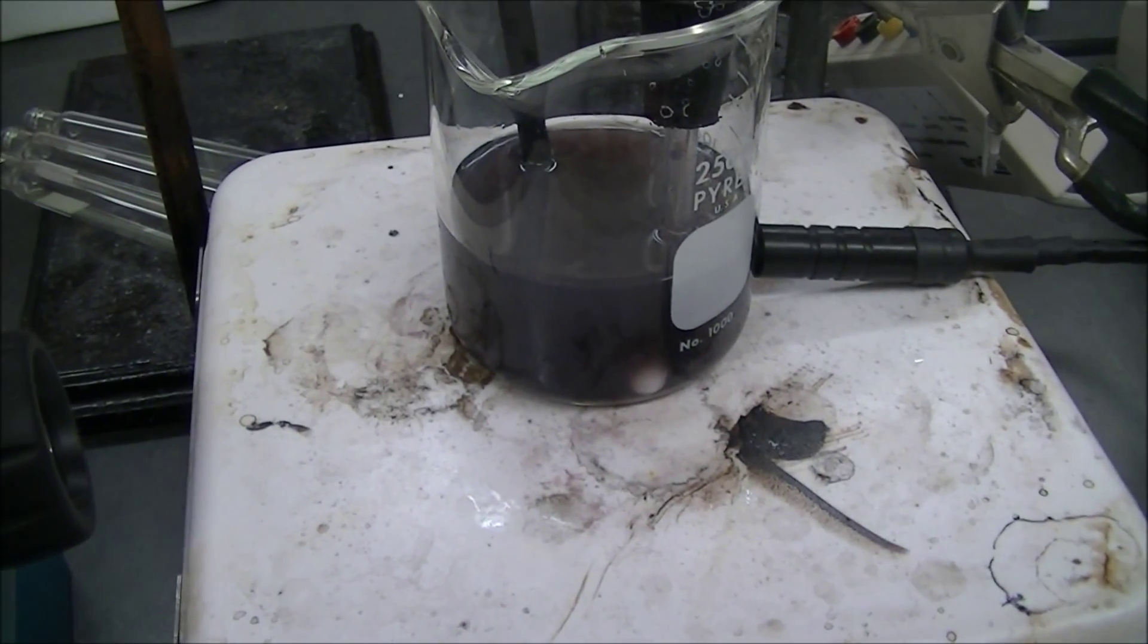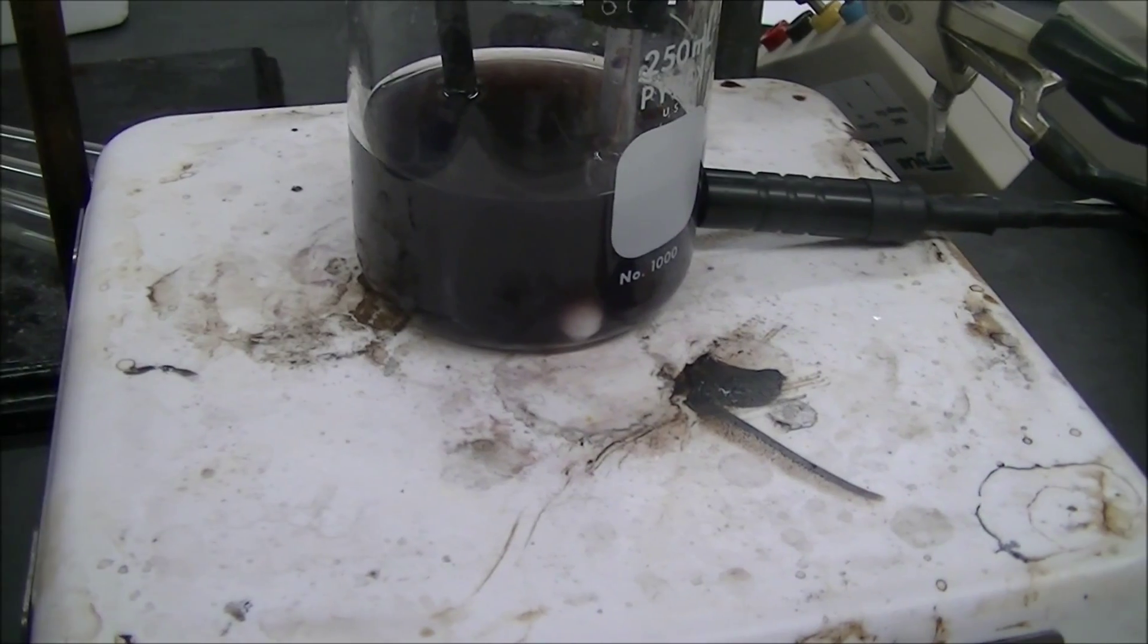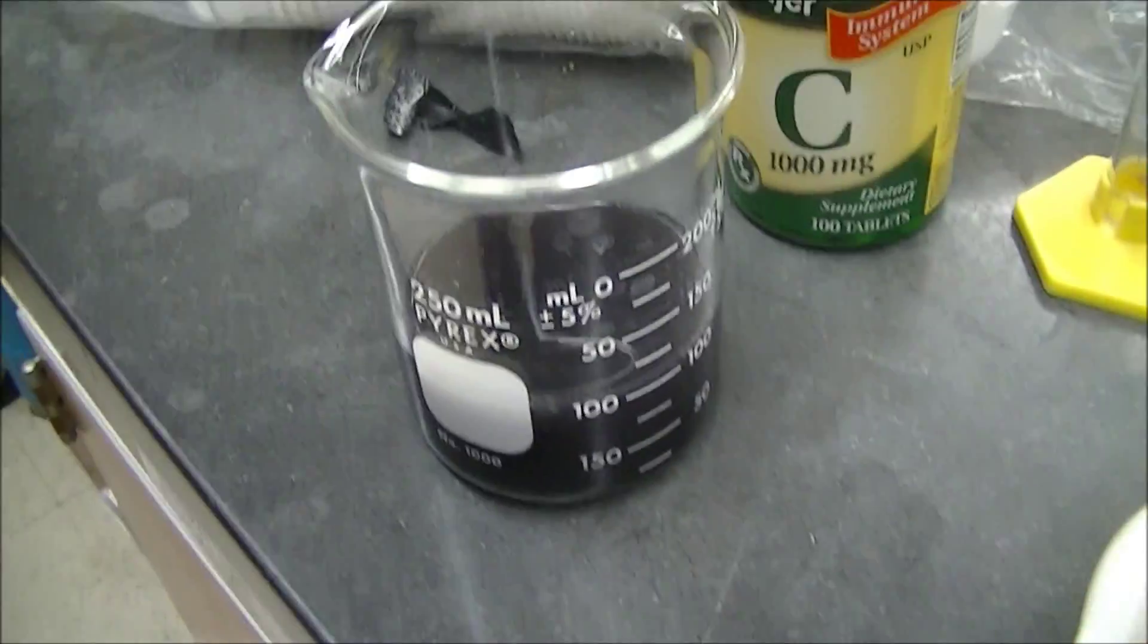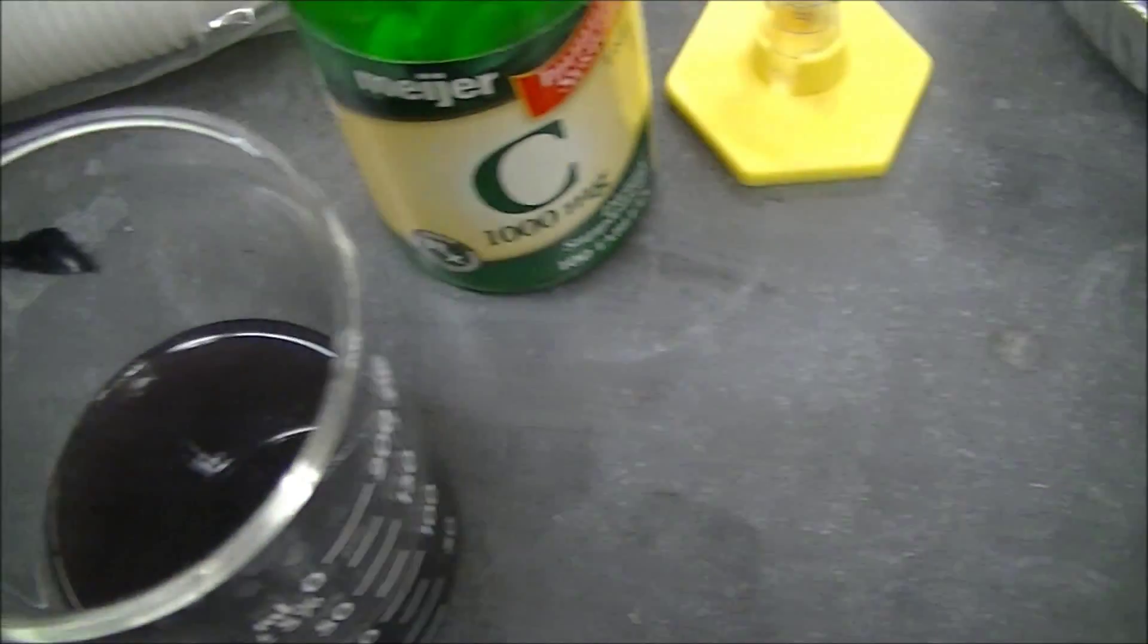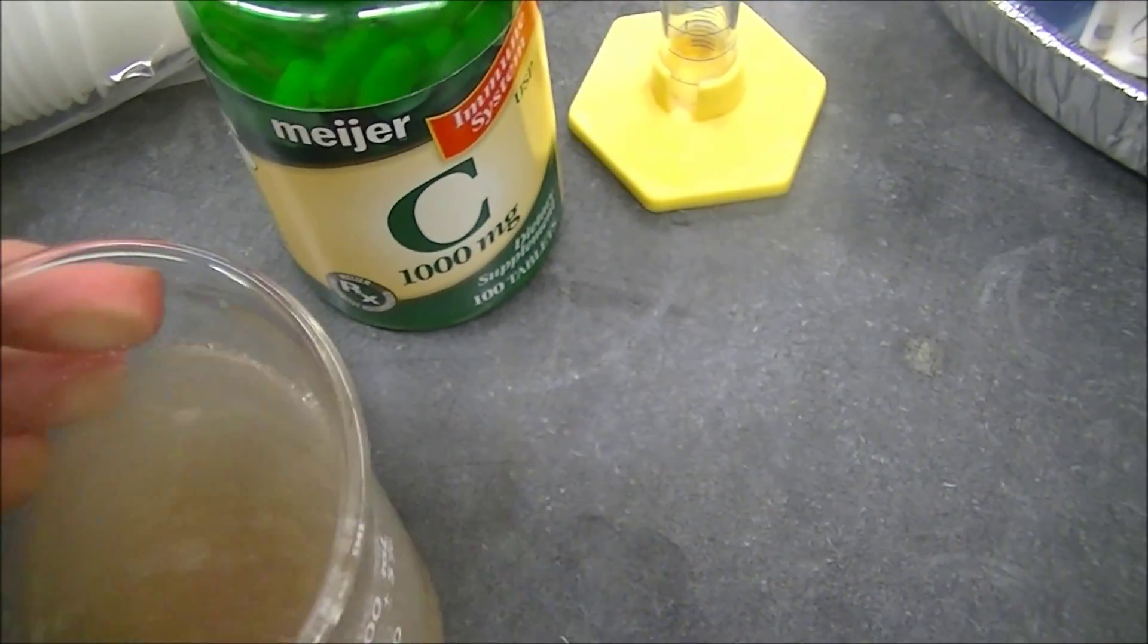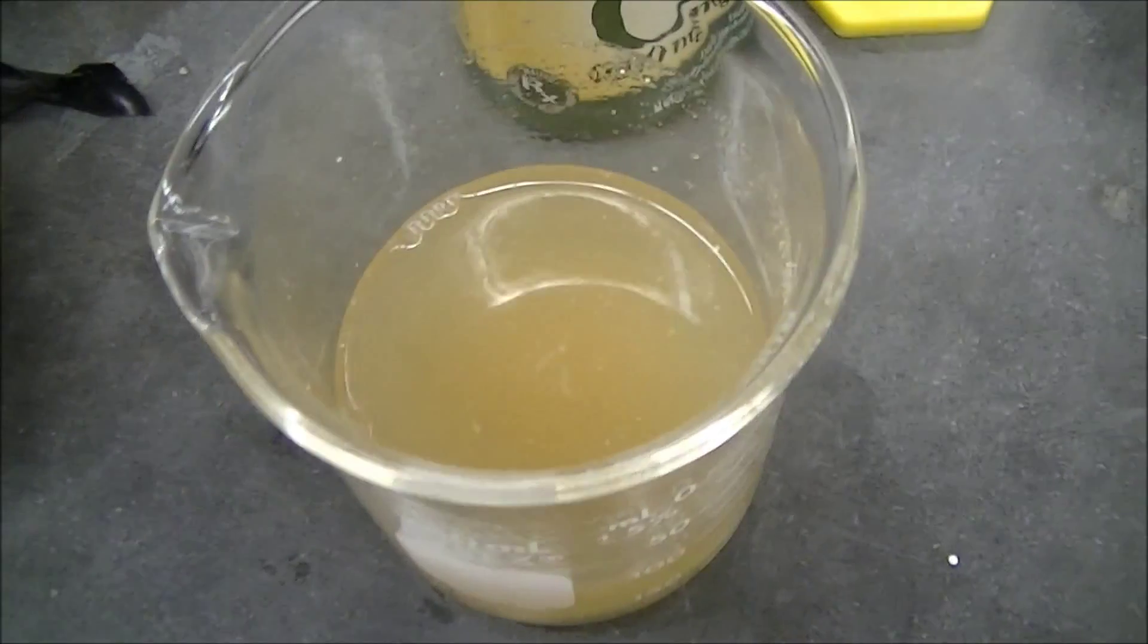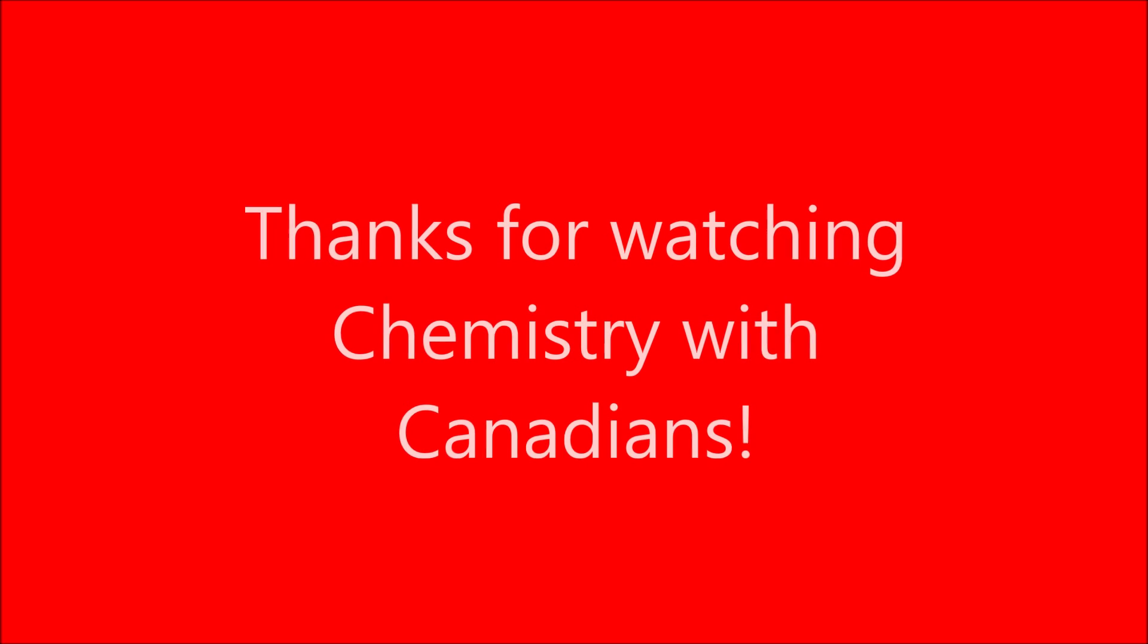So this is what it looks like now that everything's reacted. It's pretty obvious, you can tell when it goes. That's what the starch is there for, so you can tell when all the ascorbic acid is gone. To dispose of our nice-looking black stuff now, all we're going to do is take some vitamin C, crush it up, and pour it in there. It's probably one of my favorite parts. You don't really need that much. And it's back to its original color basically. So now it's just good to go down the drain. Be sure to fish out your stir bar.